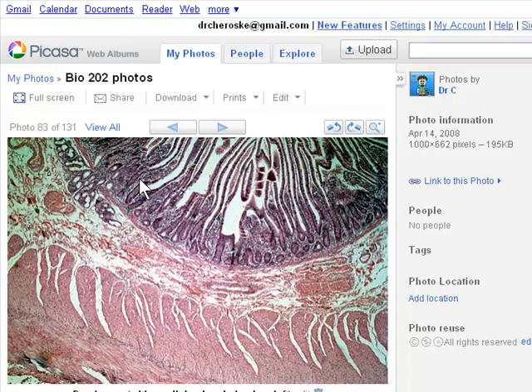But we still have either the duodenum or the ileum. So the question is, what's the identifying feature then with the duodenum? With the duodenum, there are duodenal glands that you see here within the submucosa that secrete an alkaline mucus. This is to neutralize the acidic chyme that's coming down from the stomach. So duodenal glands, also known as Brunner's glands, only found in the duodenum. So that's your key thing for them to find in the duodenum. Tell them they're looking at the duodenum.